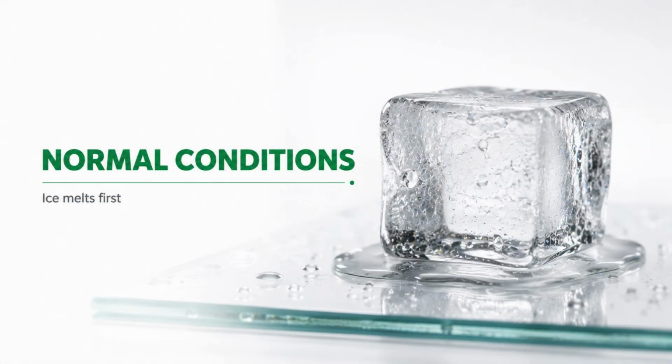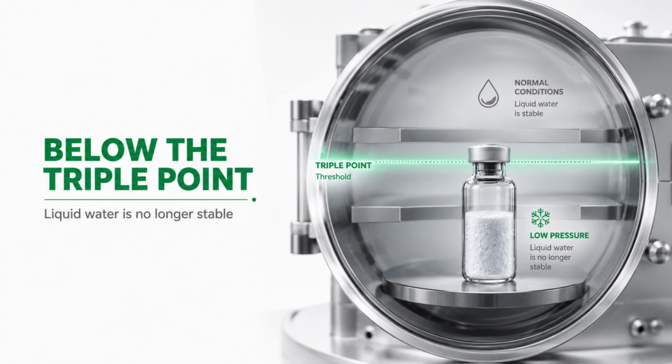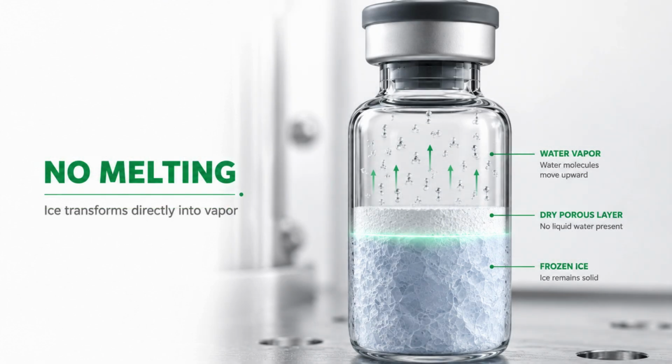Under normal conditions, ice melts before it evaporates. But inside a freeze dryer, the chamber pressure is reduced below the triple point of water. At this low pressure, liquid water is no longer stable. As a result, ice bypasses the liquid phase and becomes vapor directly, allowing drying to occur while the product remains frozen.